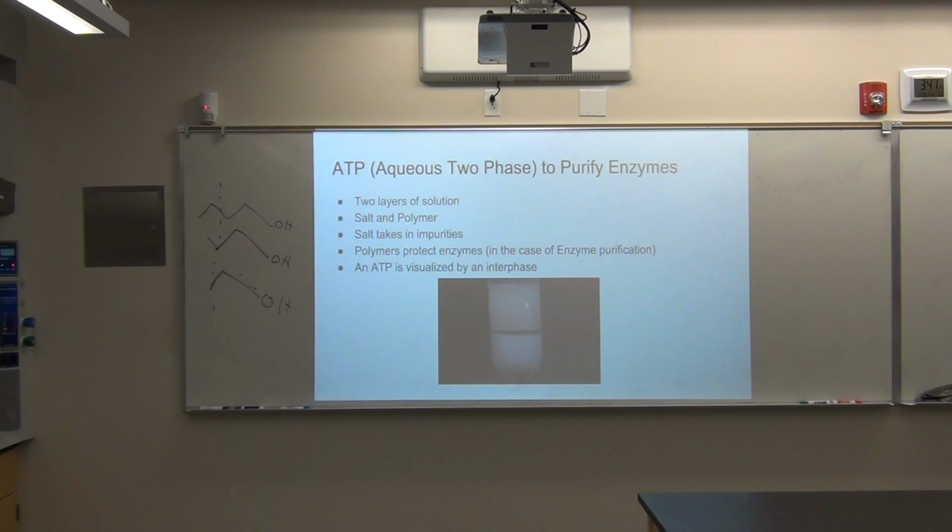And that was the last couple of days. Well, we began this Winternship with that procedure, and I've actually put that procedure into the 207 enzymology lab. That's how we isolate the enzyme used for that experiment now. And we ran it with the normal tris, and we found that it only lasted about a week, and it died off. It became inactive by isolating it in that manner.